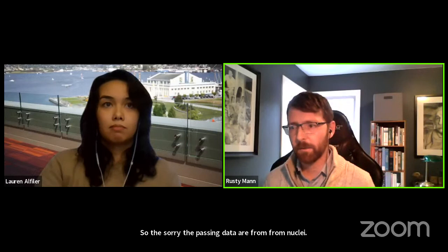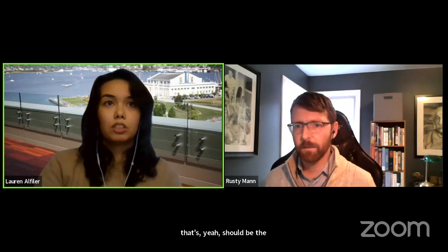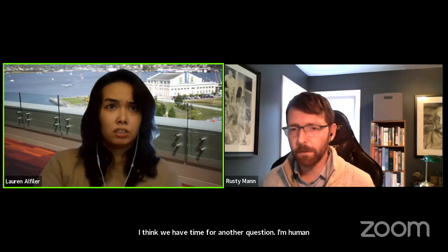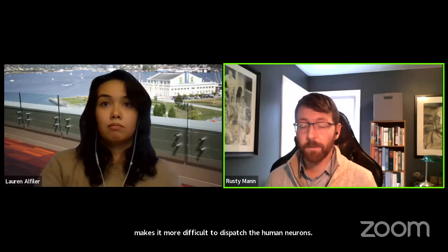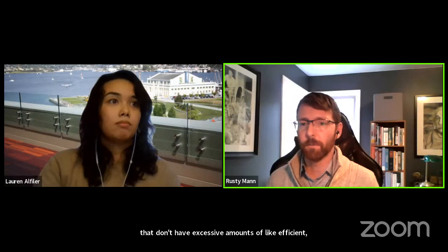I think we have time for another question. Human tissue is known to have lipofuscin. Does that make any of the steps harder? It does. That's one of the things that makes it more difficult to patch the human neurons. Ideally, you want to find cells that don't have excessive amounts of lipofuscin. You can still patch into them, but it makes it much more difficult to seal onto them.